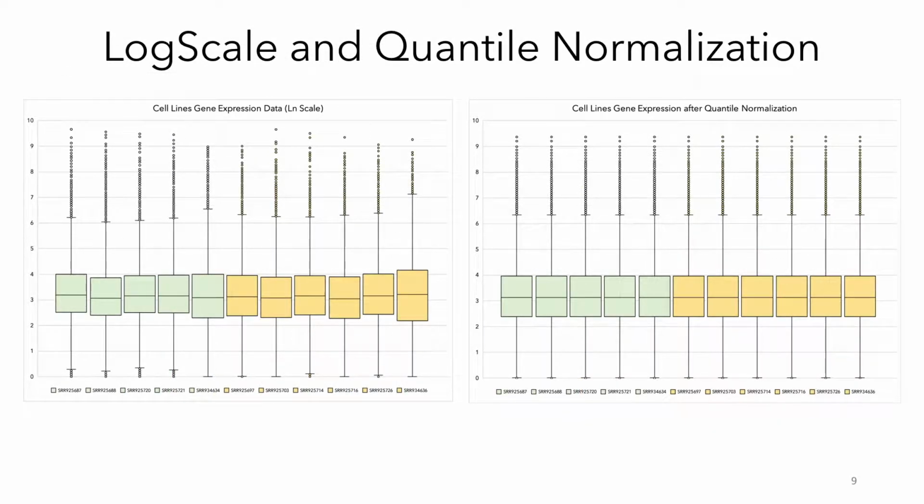If we transform our values into log scale, we see a much more normal box plot. Now I can compare values between samples without losing the detail of lower expressed values and still see the top 25% of the values clearly. Another useful transformation you might want to consider for NGS data is quantile normalization. In order to compare your samples, you might want to align their medians in the following way.